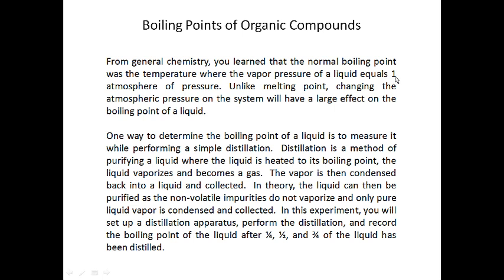The higher temperatures, actually, that's what you do in a steam pressure cooker. You're raising the temperature of the water that's cooking your food to above 100 degrees Celsius. That's what you do to sterilize something. In general chemistry, we don't talk much about lowering the atmospheric pressure, but in experiment 5, when we have our first encounter with the rotary evaporators, we'll actually see that when you lower the atmospheric pressure, you lower the boiling point.